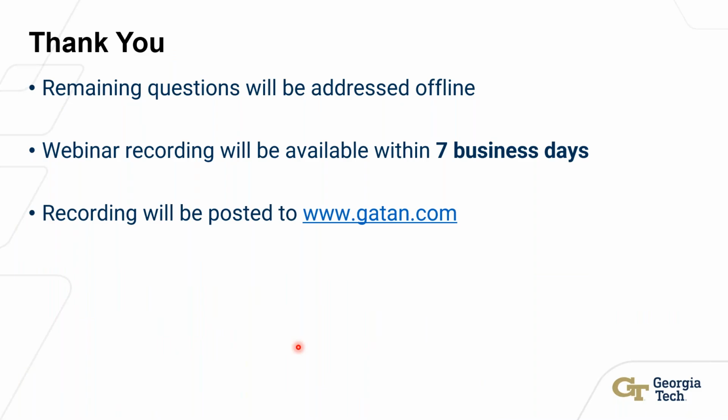Can you map different phases as well as just the orientation of a single phase material? Is that something that could be done in the future, if not today? Yeah, there's no reason why you can't do phase mapping as well. We do quite a bit of phase mapping. All you do is, when you're loading in your templates, you just load templates for two different phases. Each phase that you add essentially is going to double the analysis time, but that's all done offline.